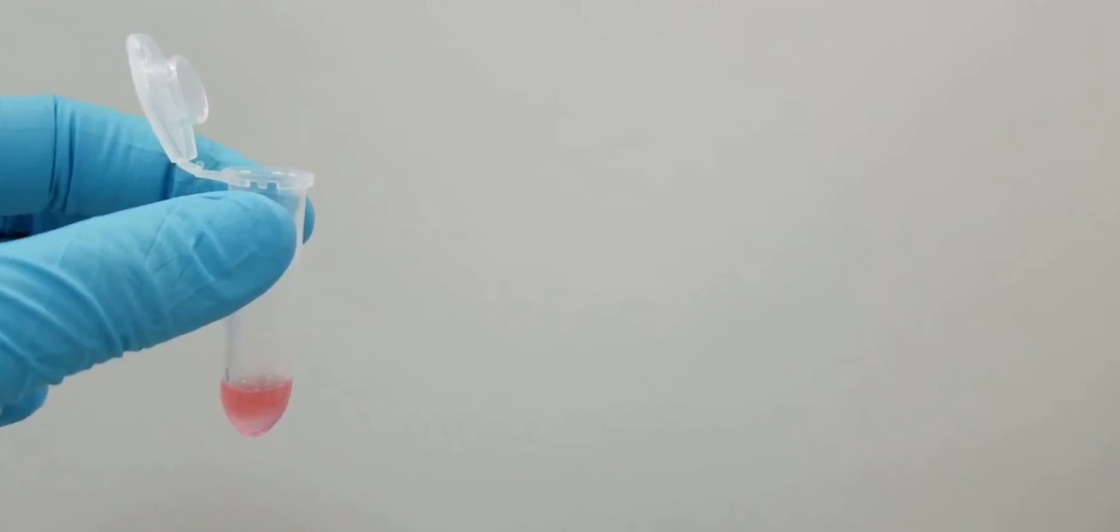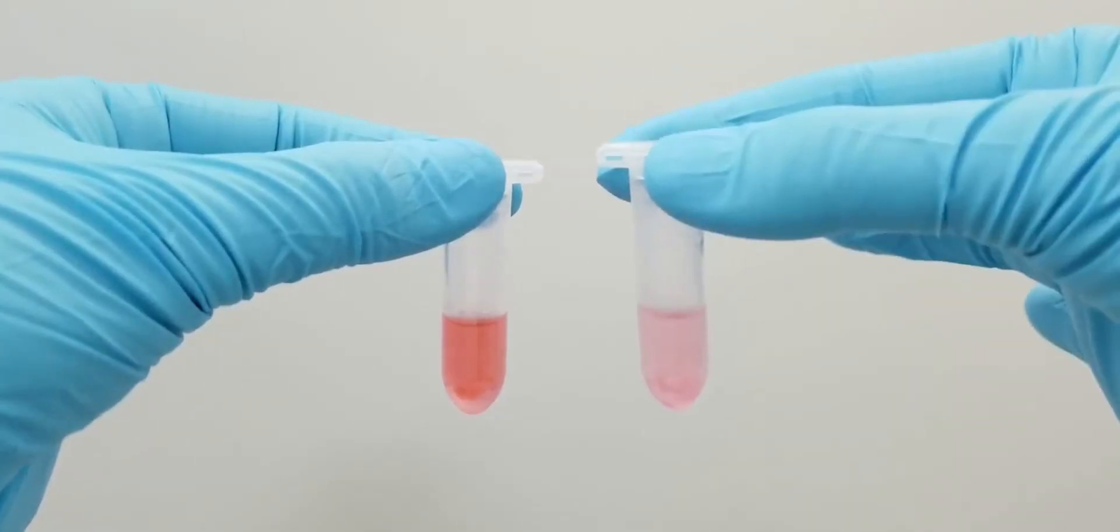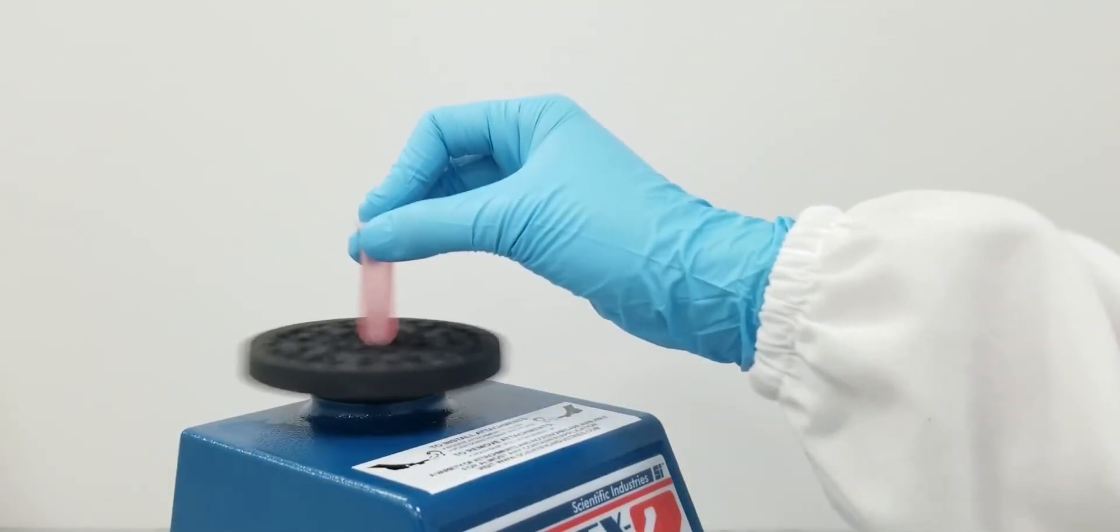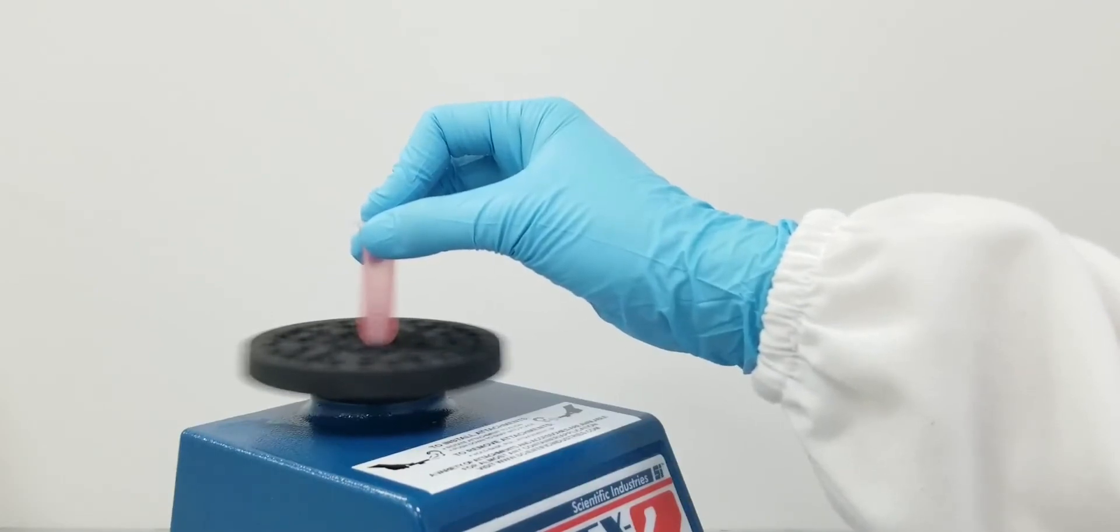If you have less than 600 microliters of the VTM, make sure to top your sample up with 600 microliters using solution A. Mix thoroughly for at least 20 seconds until homogenous and briefly centrifuge.